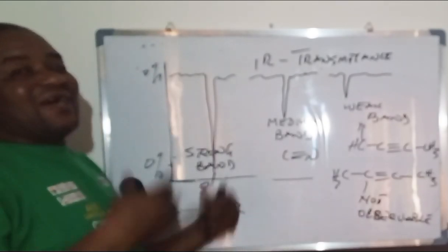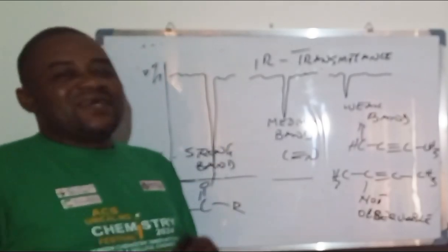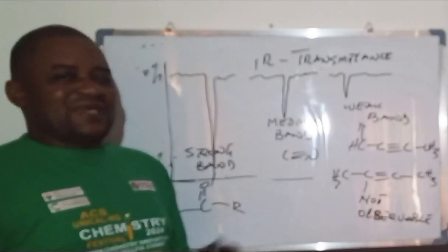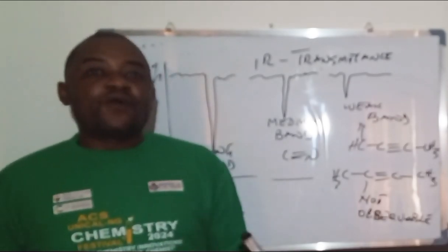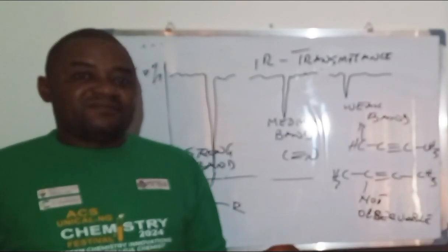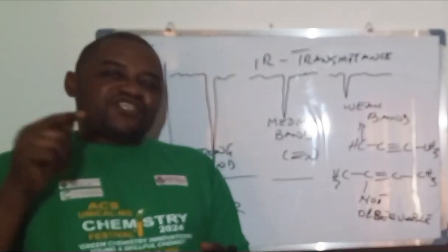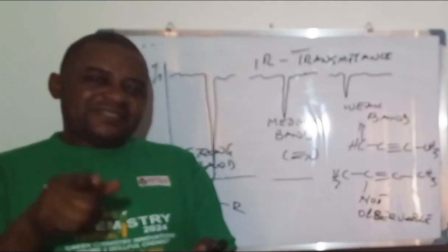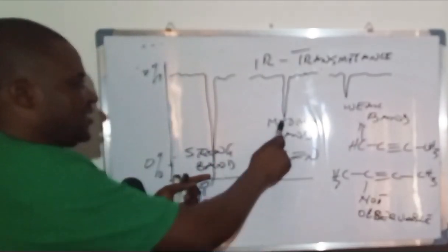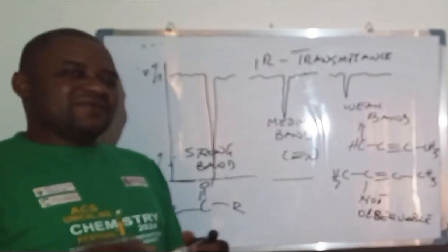You can go further and further to discuss what is happening around the display unit of the IR spectroscopy. We can also talk about the types of peaks that you can see. You can see peaks that are narrow. You can see peaks that are also broad. Of course, narrow peaks are always sharp. They have a pointed nose like this, and they look like a knife.